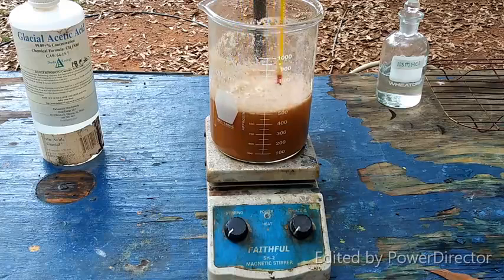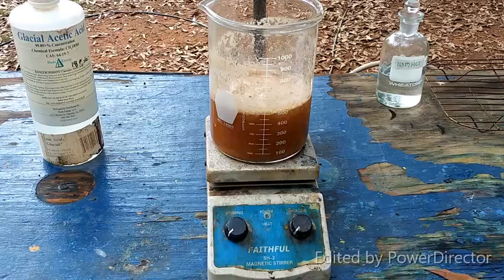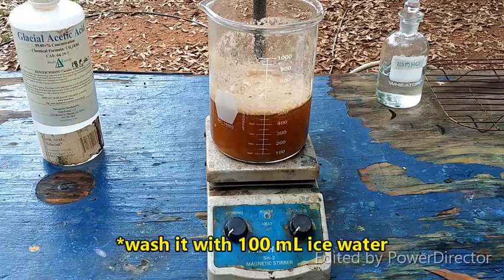Alright, well, I'm going to allow this to chill for a little while and precipitate all it's going to precipitate. And then the next step will be to filter off the anthranilic acid and wash it with water.